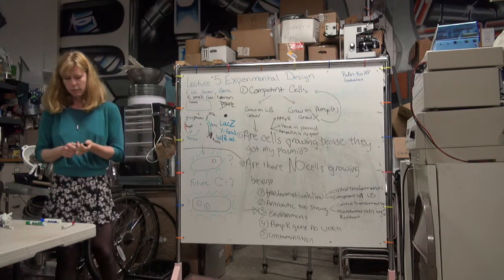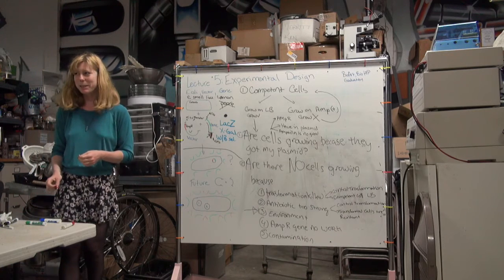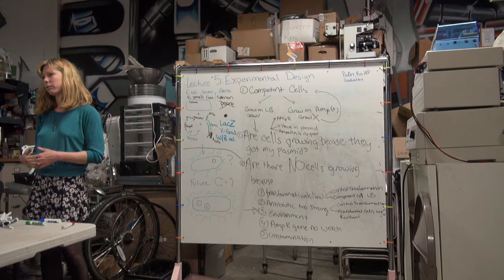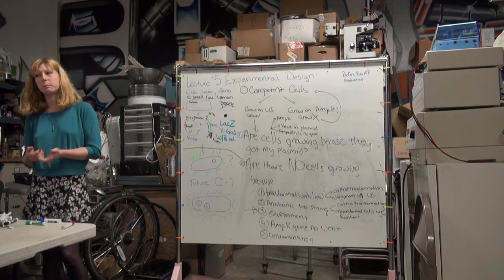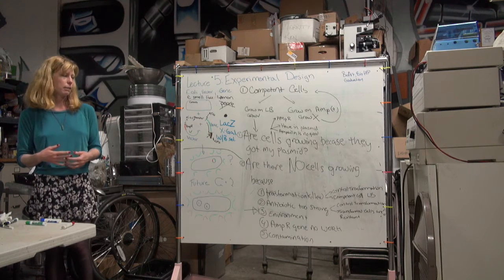Okay. So step 5, you go into the clean room and do a control dose. Yeah, you just try to do better sterile technique, right? But normally with contamination, you're going to see something grow that wasn't supposed to grow. Contamination can also be where you're like, oh, I forgot to change my pipette tip, so now there's plasmid in the mix where there shouldn't have been plasmid.